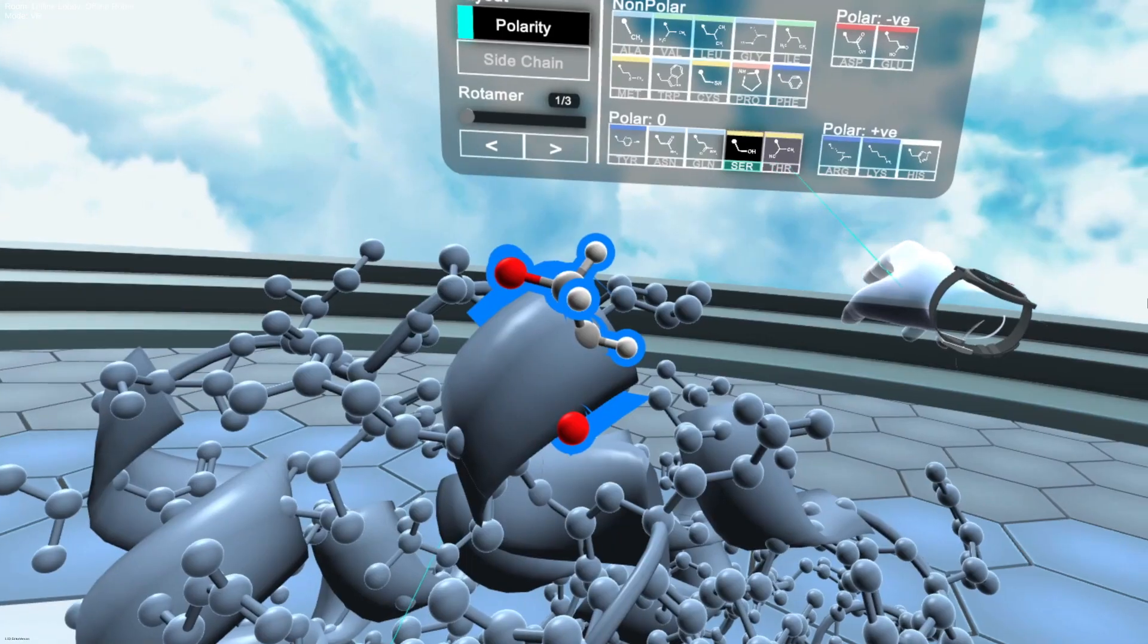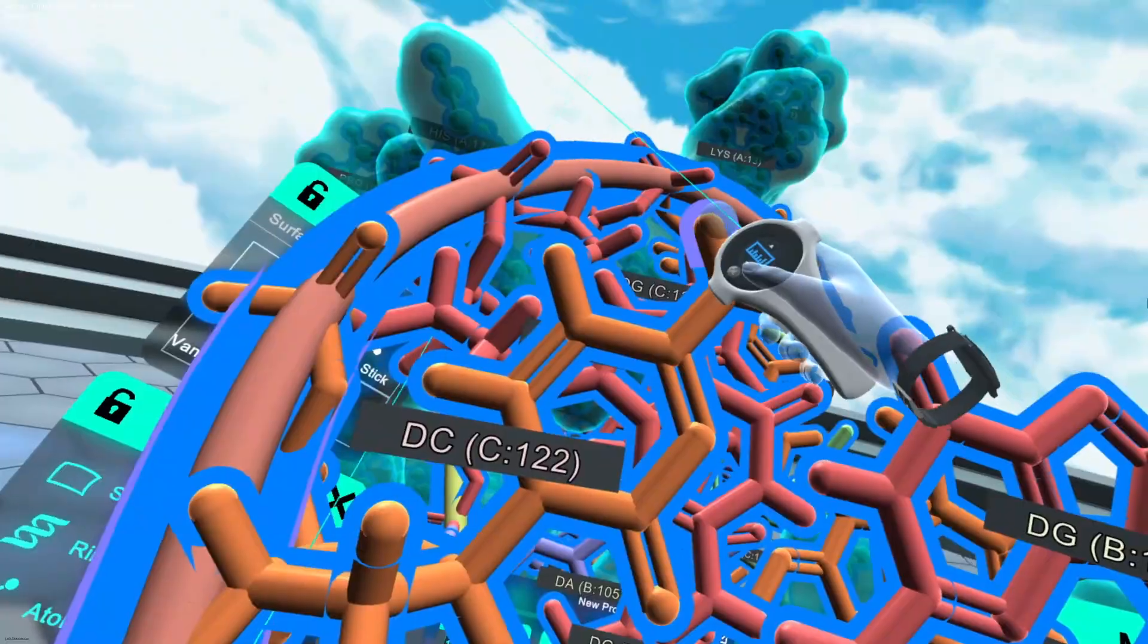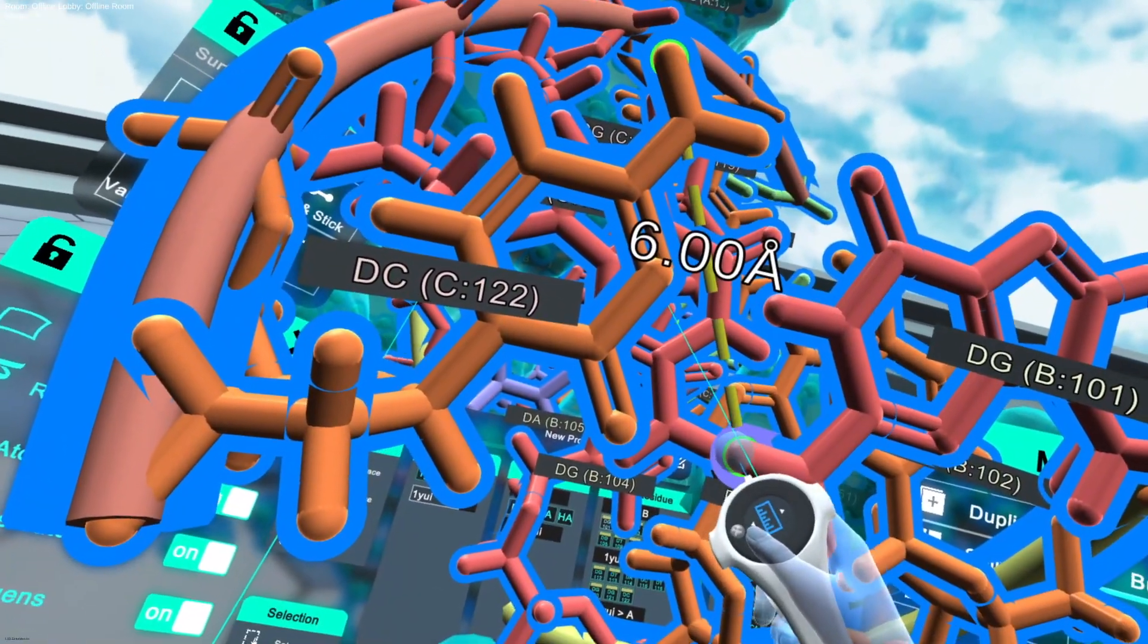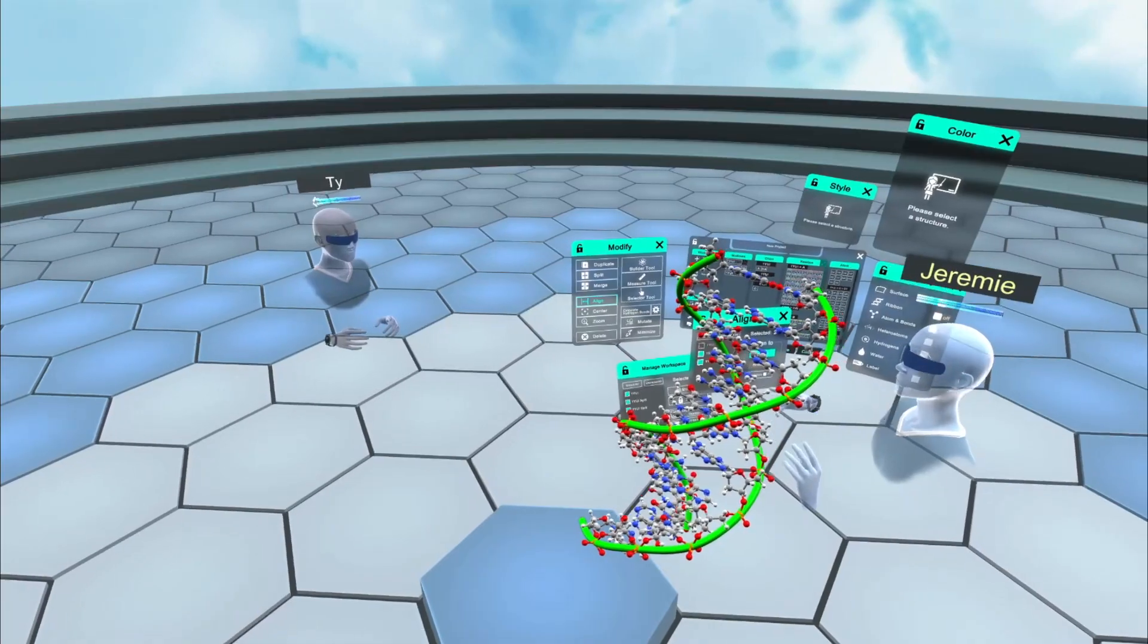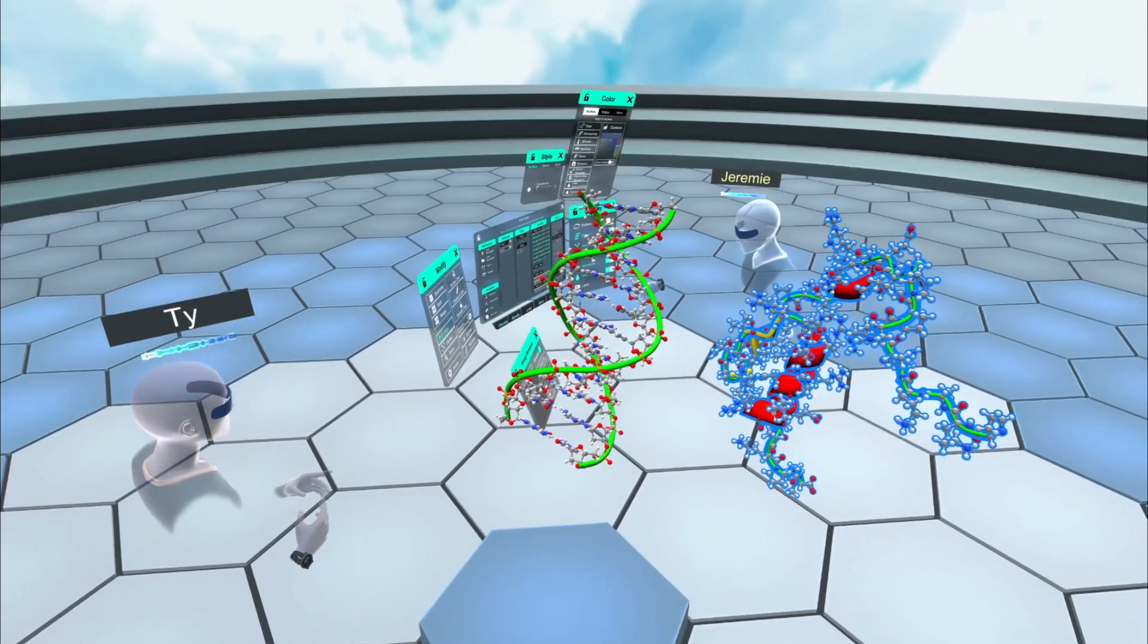Mutate atom by atom or by amino acids with the mutation menu. Select by reaching in and measure like never before. Even take a selfie with your design, build with a friend or with random strangers.